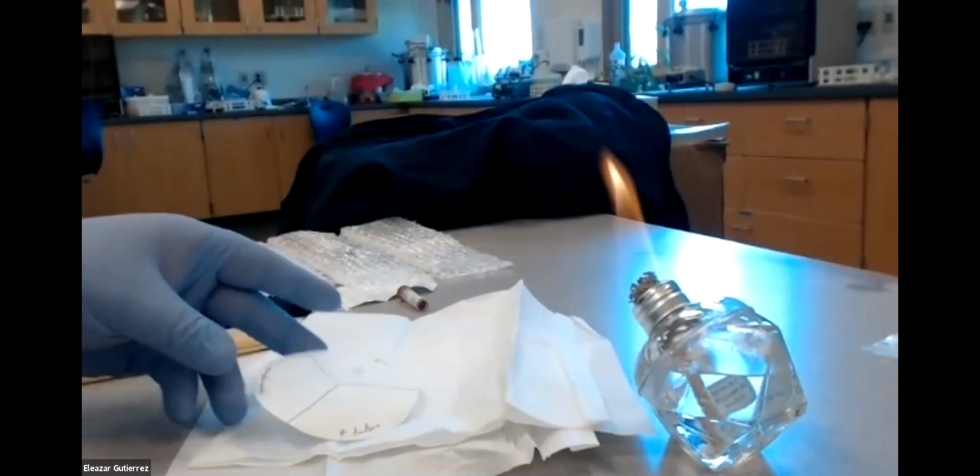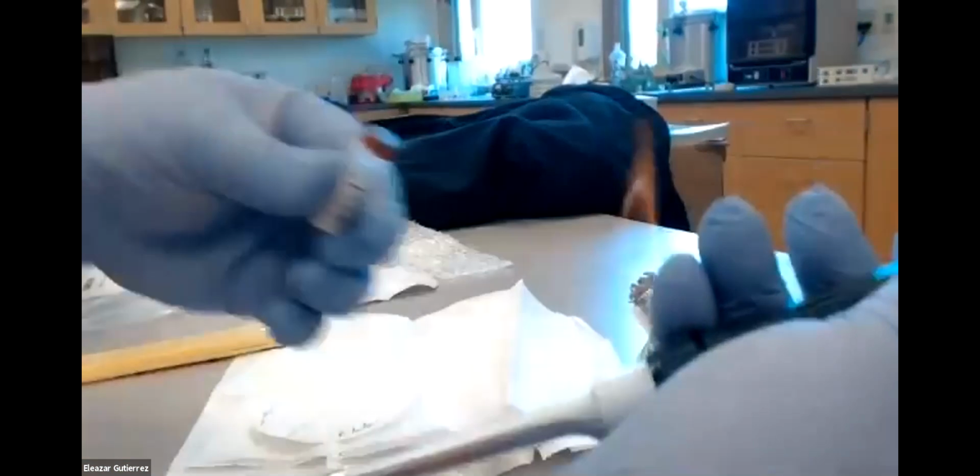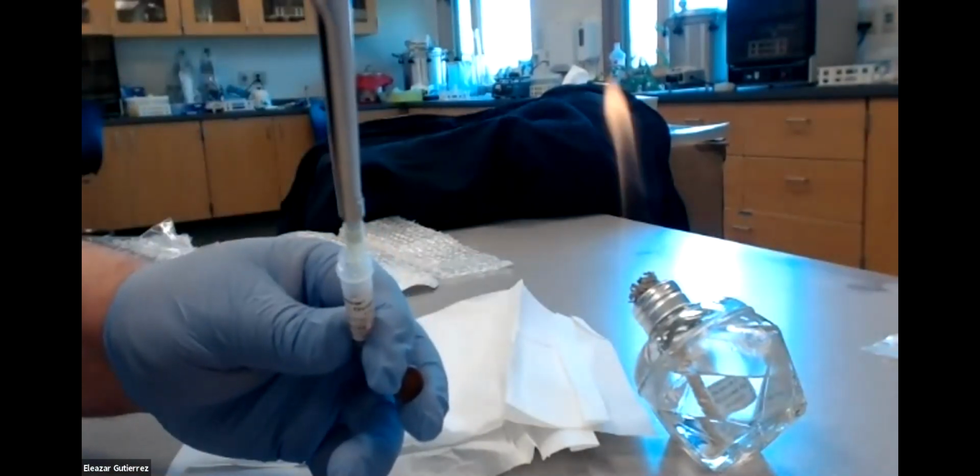And now we're going to take 5 drops of the oxidase test. And I'm going to cheat because I can. So I can use a little pipette dialed at 200 microliters. That's approximately 5 drops. There it is, 200. And grab this guy right here. I'm going to open it. I'm going to take out my 5 drops, like so.